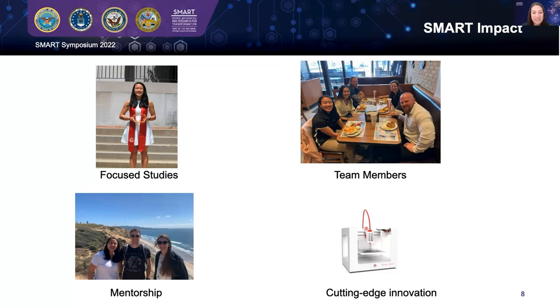Awesome. Thanks so much, Priscilla. There was a question in the chat that you just answered about what your chip materials were made of. Yeah, so like I mentioned in the chat, the chip itself was made out of PDMS, which is a really common material used in organ on a chip technology and other microfluidic devices, but the mold itself was made out of resin. So they're pretty simple materials, pretty affordable, nothing super complicated.